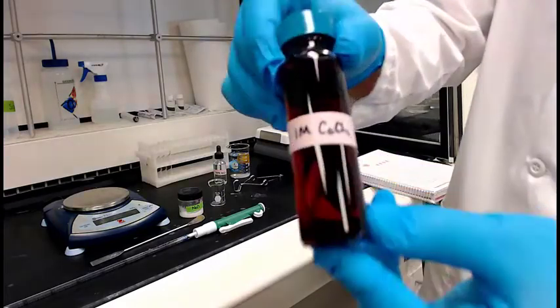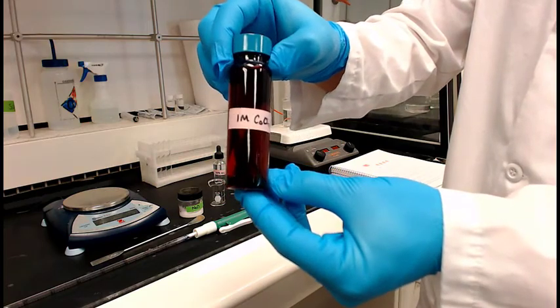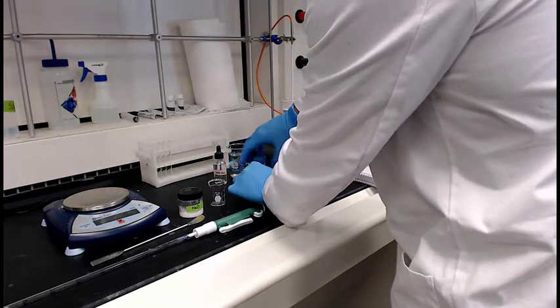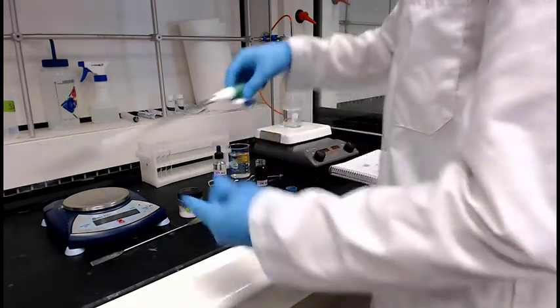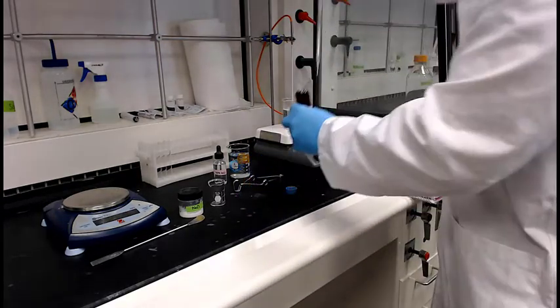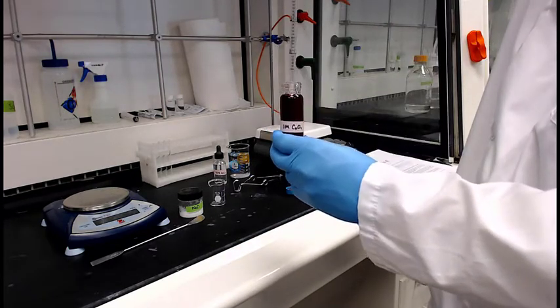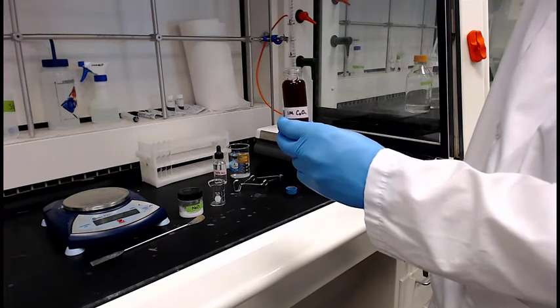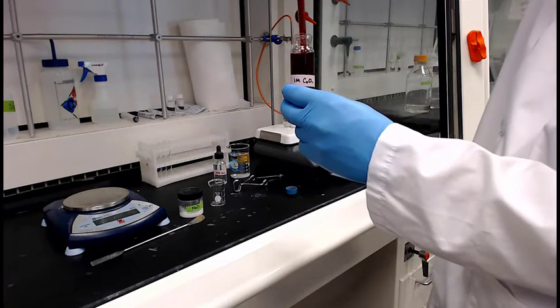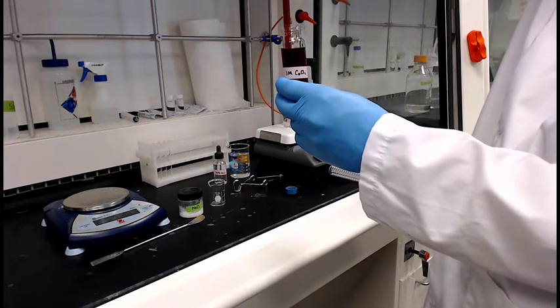Okay, what are we going to do first? There's the 1 molar cobalt-2 chloride. We're going to create our initial conditions, find our original equilibrium. We're going to do that by, again, 5 mils. This is qualitative again, so it doesn't have to be exact. We're just basically pushing equilibrium around, so we're going to be very close, but we're not setting up a calibration curve.